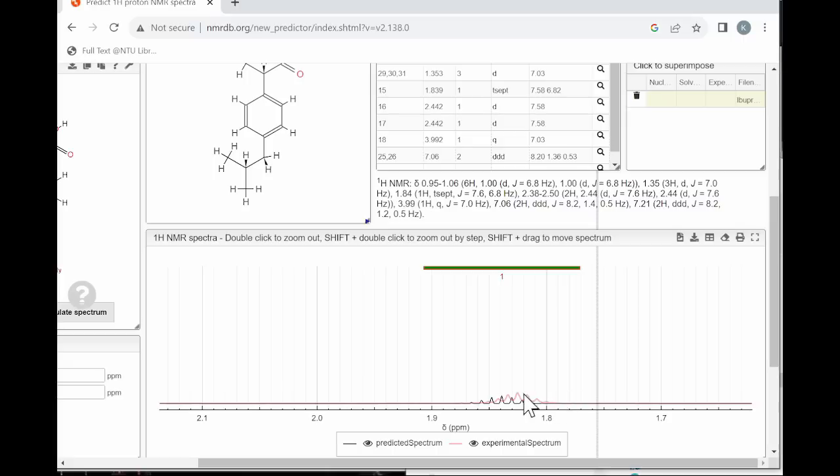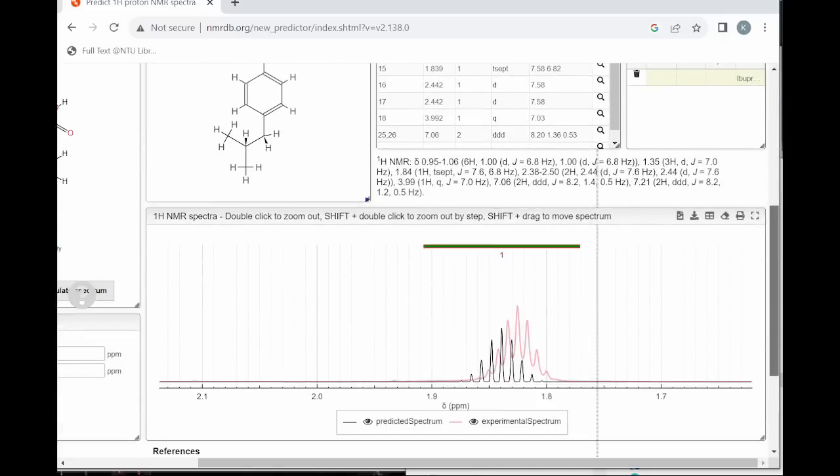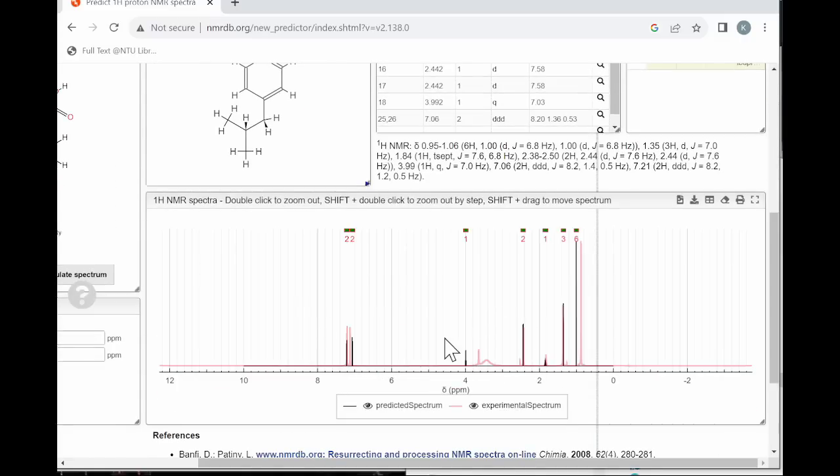Now we can zoom around, and we can see there's a pretty good fit between the spectra. We explore peak by peak and figure out which peaks belong to our test compound. That would be the validation process, if we can account for all the peaks here. Then we validate its structure. A more detailed process of the structure validation is described step by step in the following section.